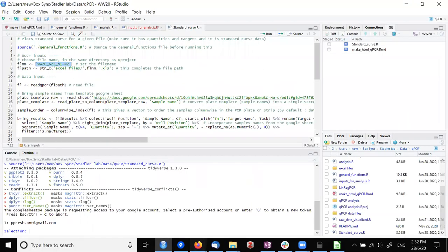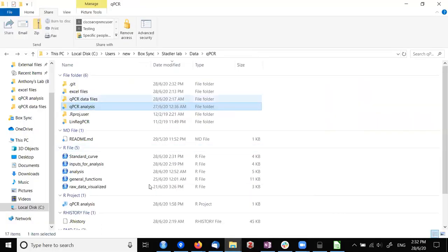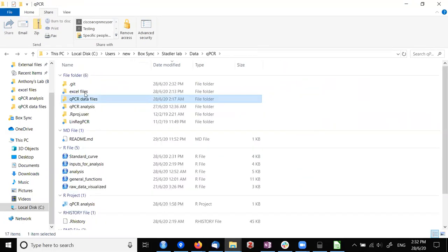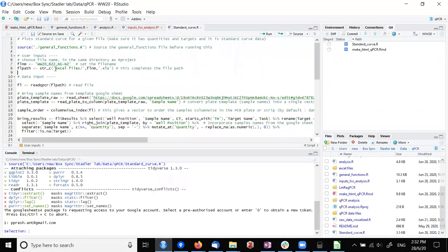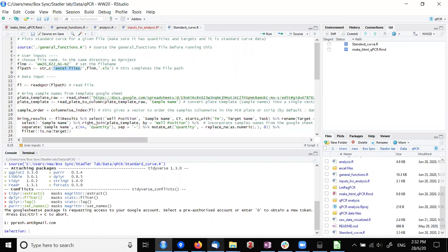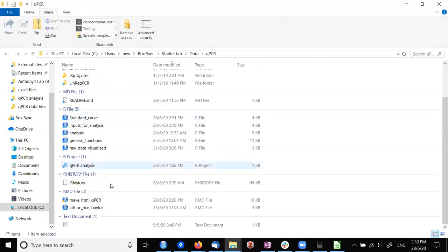If you download it to your computer, and then we've been putting these raw data files in Google Drive. So you would download that into another thing here and then save the Excel files into this folder with the same name. It should work for you. So I have the directory link relative. It starts with the folder where this R project is. So the advantage with having an R project is it knows that it is starting from this directory. It's starting from this directory, so this R project has all the R files in it.